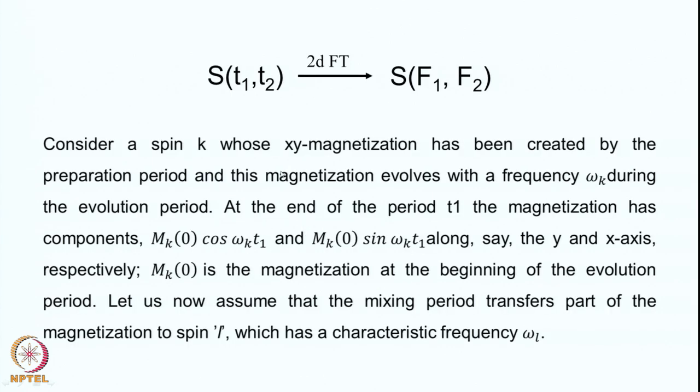So, now let us put it a little bit more formally. Here we have S, T1, T2. We have generated a two dimensional data body as a function of time variables T1 and T2.